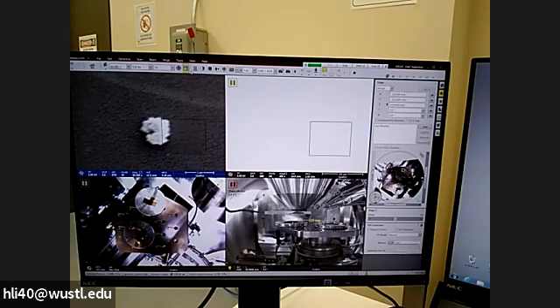I also suggest use reduce area, which is we just scan this small region on the sample. Okay, so now what do I adjust? I bring sample to focus. Okay, this is focus. Okay, we leave it there. We come back to here again.